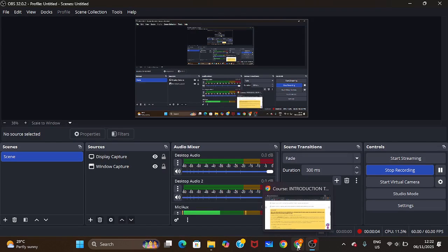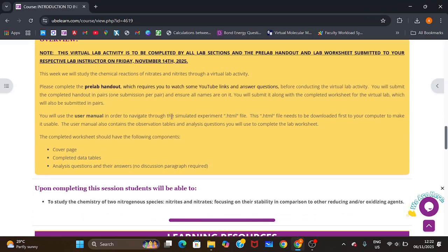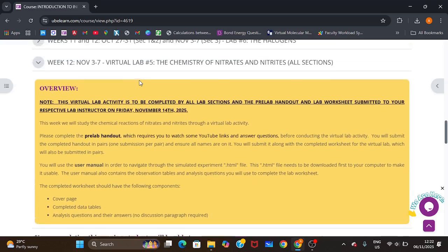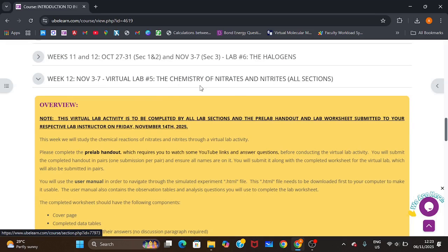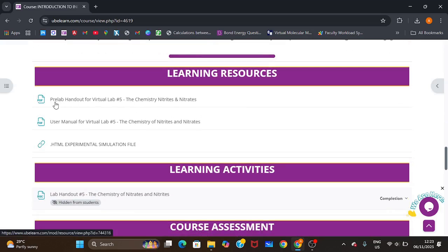All right, guys. So the purpose of this video is to basically explain to you how you will download and do the virtual lab for lab number 5, chemistry of nitrite and nitrates. Once you access your Moodle page, you're going to download 3 files.